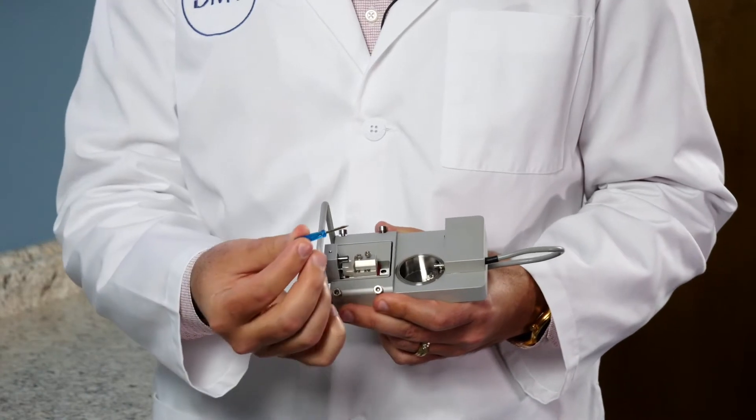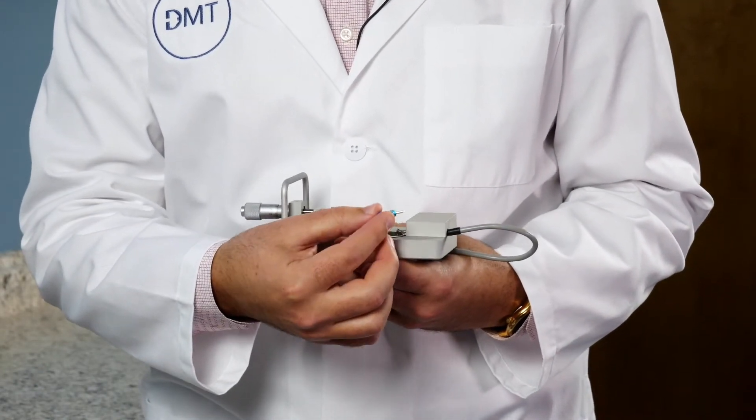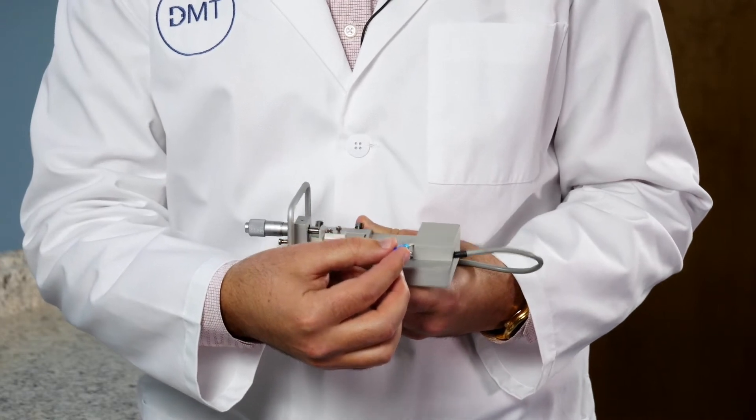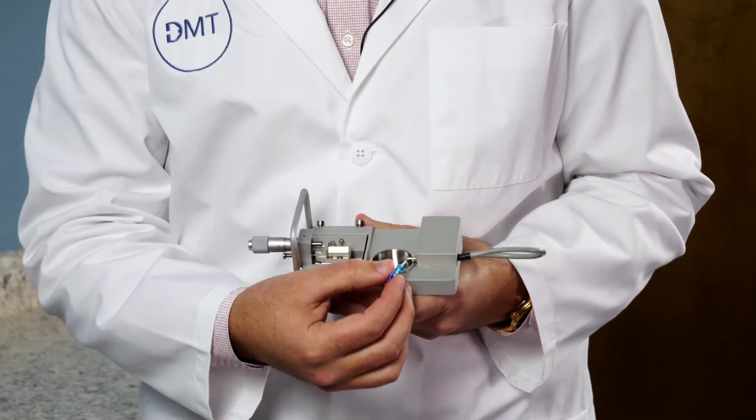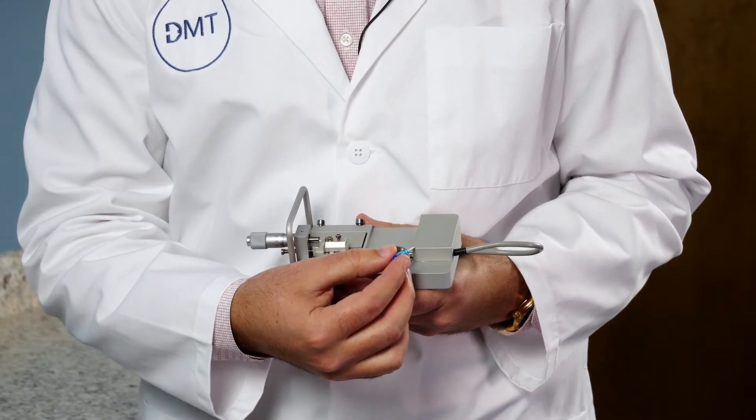Then you will need to take your small screwdriver and loosen the back screw that's closest to the force transducer. Now you'll need to be careful when doing this as you do not want to put extra pressure on the transducer itself.